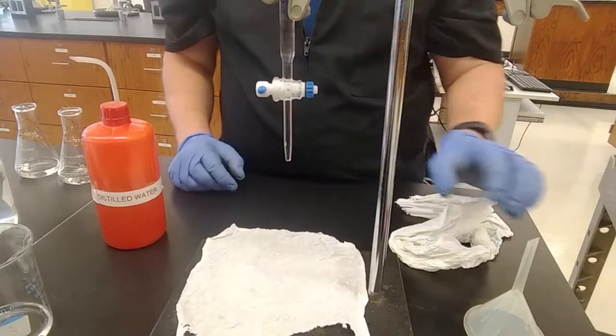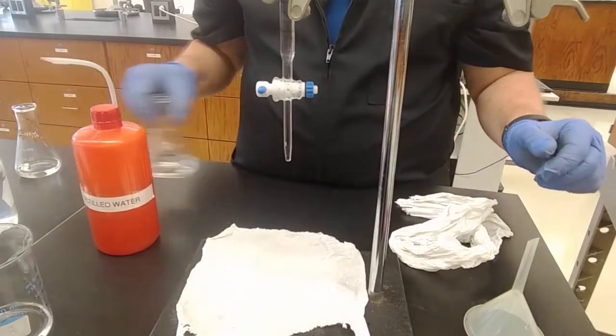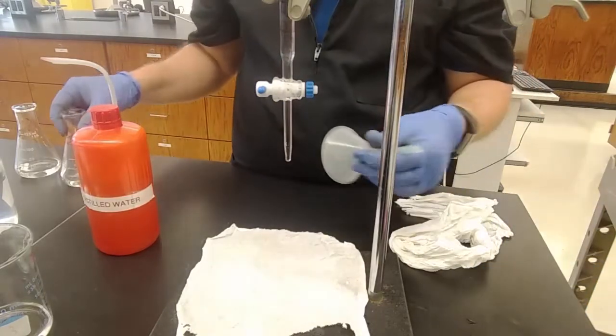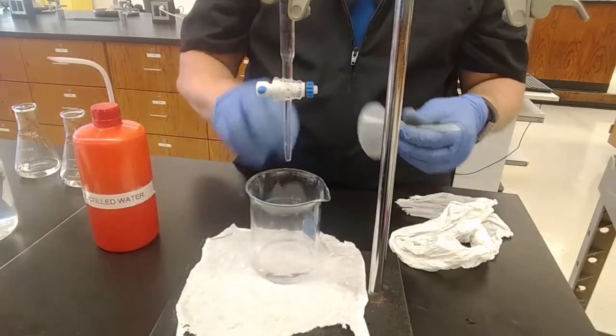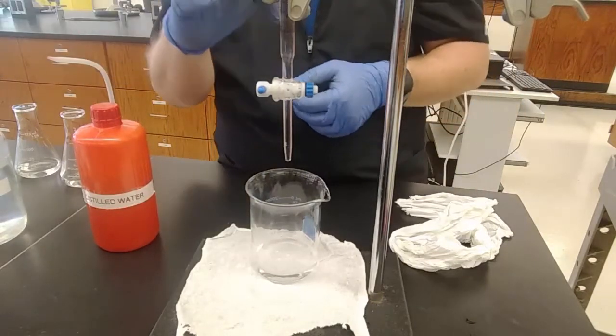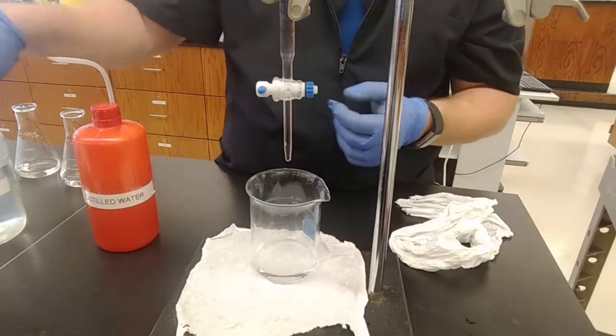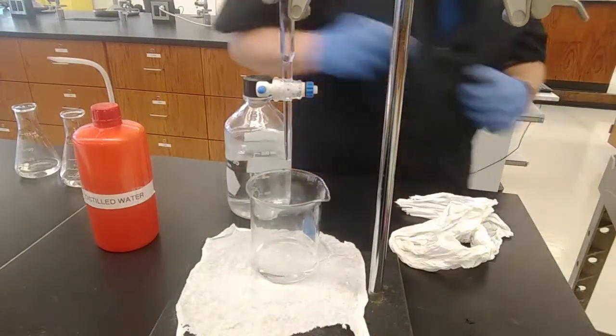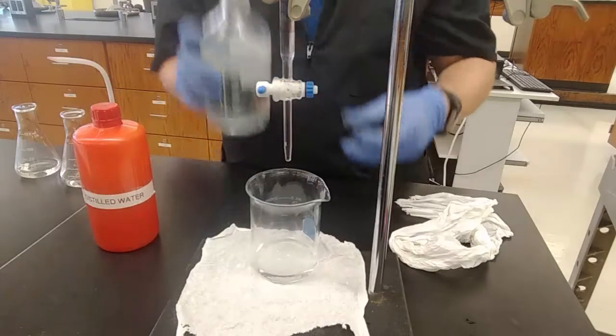All right, I need to refill. I do not refill with experiment number two underneath it, in case I overflow, it would drip in here and ruin it. So, put my waste beaker underneath. I need to refill because I don't have 17 milliliters left. I'm at 20 point whatever, and it only goes to 25, so it'll run out.